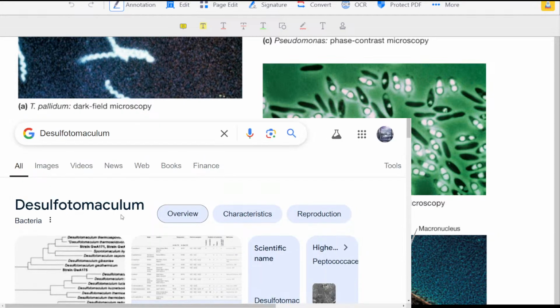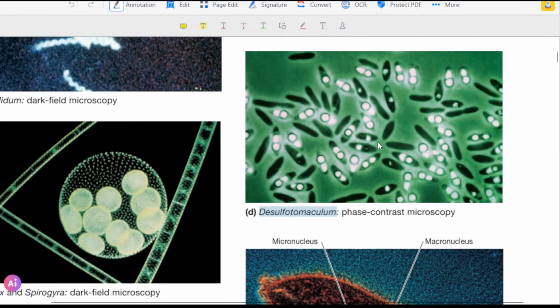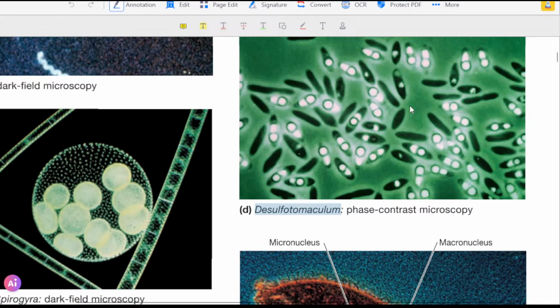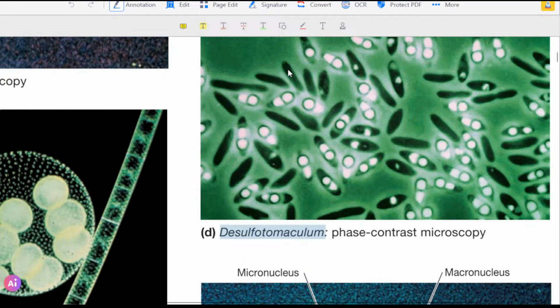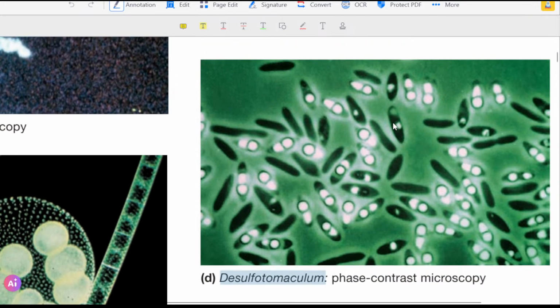Oh, it's a bacteria. I thought it was a protozoa. When did bacteria start looking like this? I see, so it's a bacillus. It's not like a V-shaped bacteria. Their ends are actually quite pointy, which is not common in bacillus, but maybe this shape just looks like this. Usually, all of them are round.